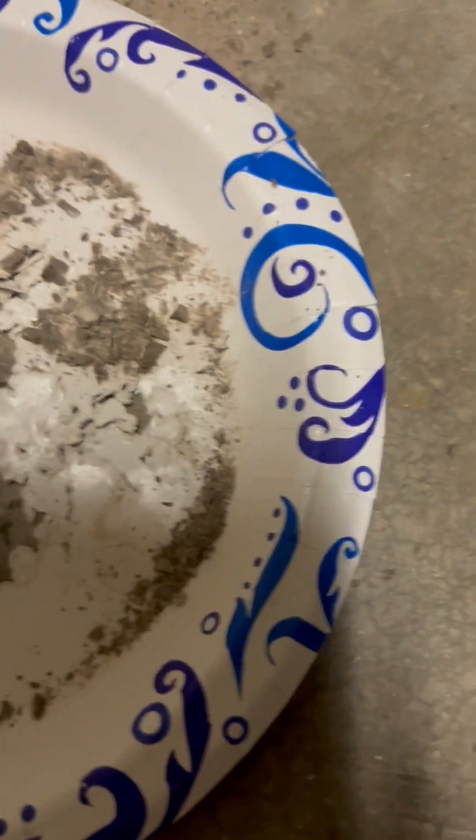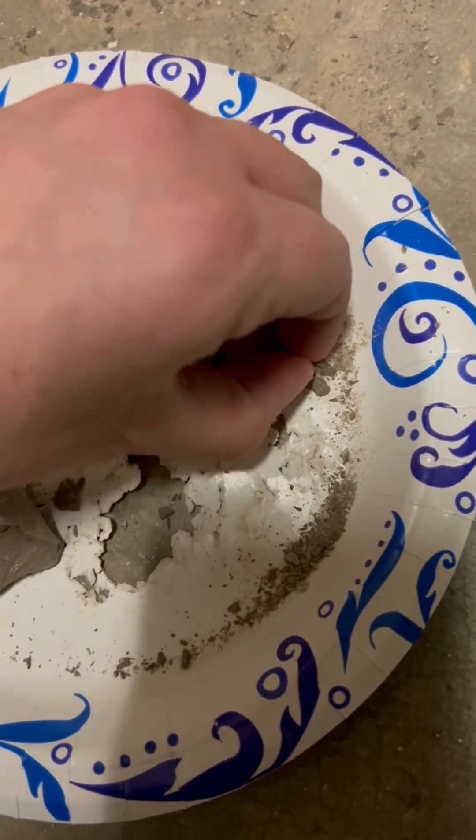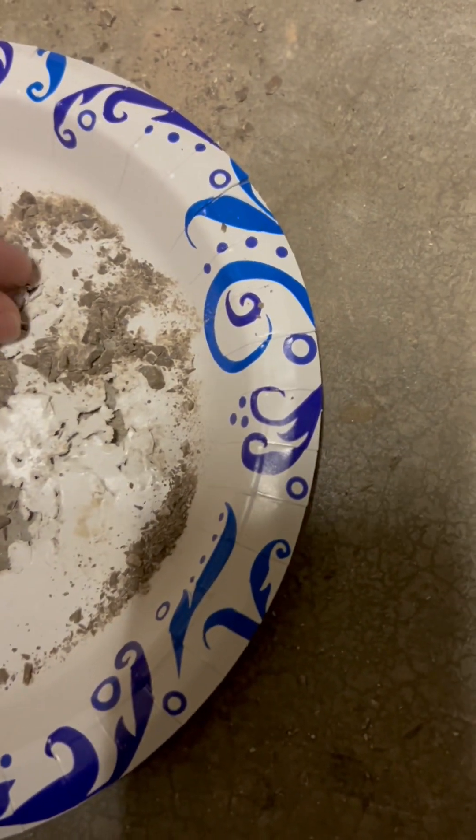Start by crushing it up. I'm going to put these little granules in this mason jar.